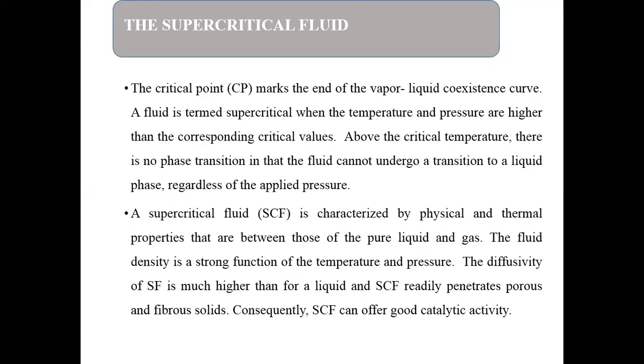A supercritical fluid is characterized by physical and thermal properties that are between those of the pure liquid and gas. The fluid density is a strong function of temperature and pressure. The diffusivity of a supercritical fluid is much higher than for a liquid, and supercritical fluid readily permeates porous and fibrous solids. So, supercritical fluid can offer good catalytic activity.